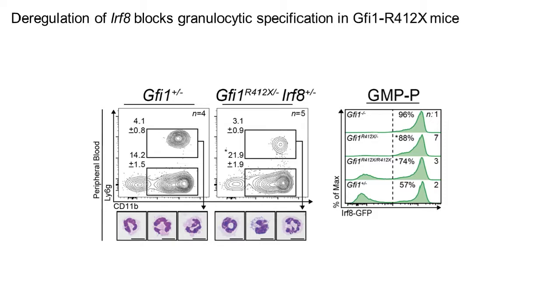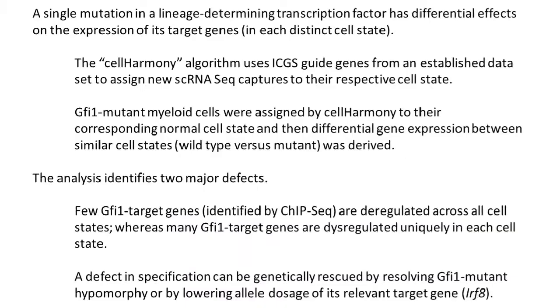as highlighted by the abnormal morphology. In summary, through our multiomics approach, we were able to demonstrate that a single mutation in a lineage-determining transcription factor has different effects on the expression of its target genes in each distinct cell state.